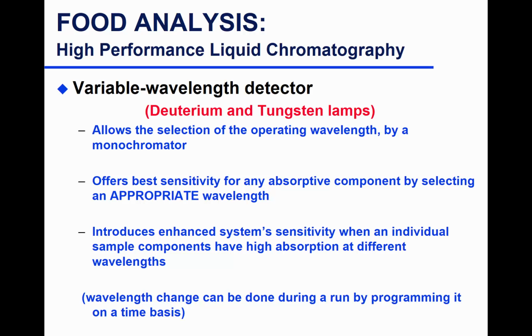So in the caffeine lab, we selected 272 nanometer. With that other instrument that we showed as a demonstration, we had to select the slit that allows 272 to enter and hit your sample. So basically, you select the appropriate wavelength. That is when you know from a photodiode array detector, let's say, that your maximum absorbance occurs at 272, then you can select for that.